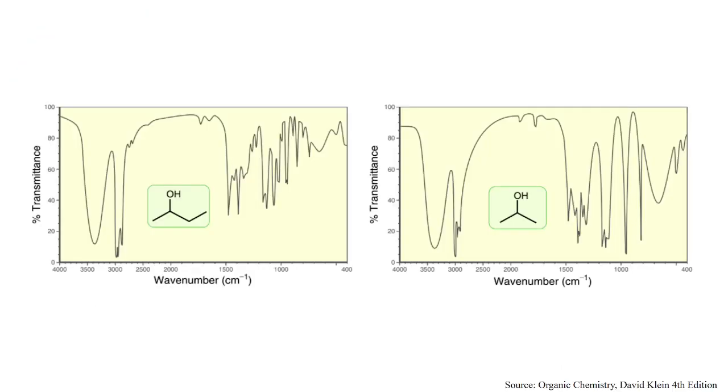So this is an example of a graph a spectrometer could produce, and the proper terminology for this is an absorption spectrum. You may hear me call it an IR spectrum. That's what I called it when I was taking OChem, and you can refer to it as either an absorption spectrum or an IR spectrum. It doesn't really matter.